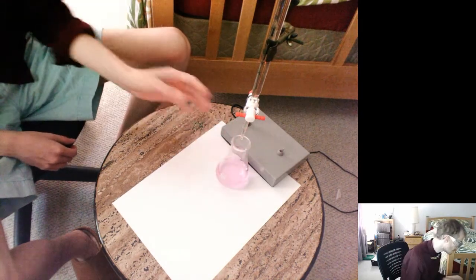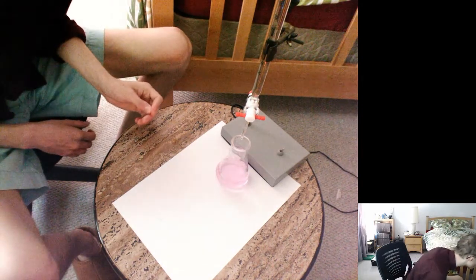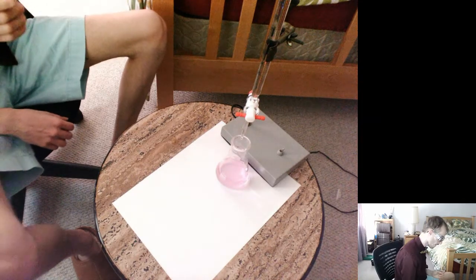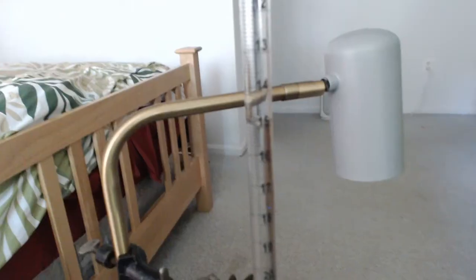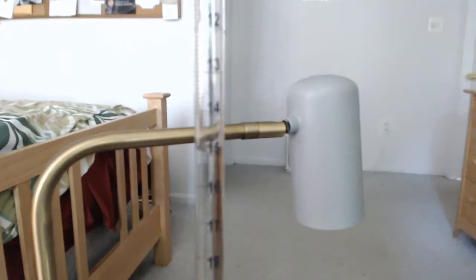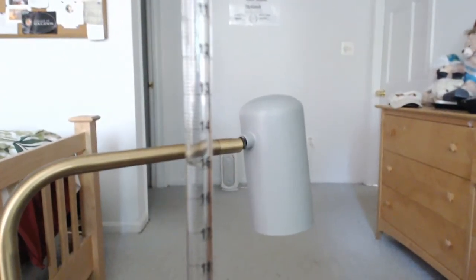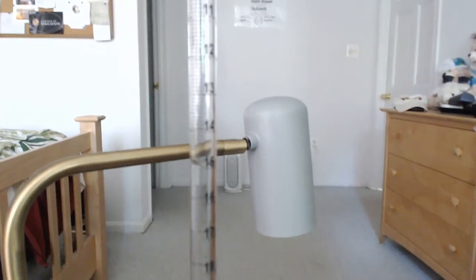So I'm going to go ahead and put in my volume that I measure on the Buret, which maybe I'll help you guys see with another camera, but it looks like almost exactly 15 milliliters of water. As you guys can see, that liquid is right at that 15 milliliter mark. It's hard to see because of the focus on this camera, but the bottom of the meniscus is right at the 15 milliliter mark. So that's the number I'm going to write down.